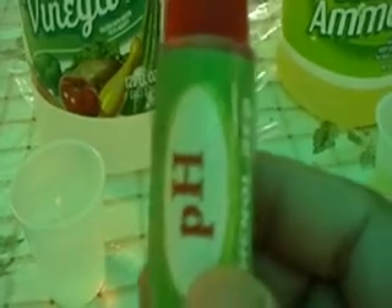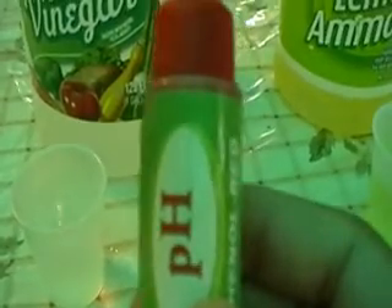The one last thing that you need — and you can find this at any pool supply store — would be a bottle of phenol red. It's about $5 at any pool supply store. Phenol red is basically a pH indicator which changes colors at a certain pH.